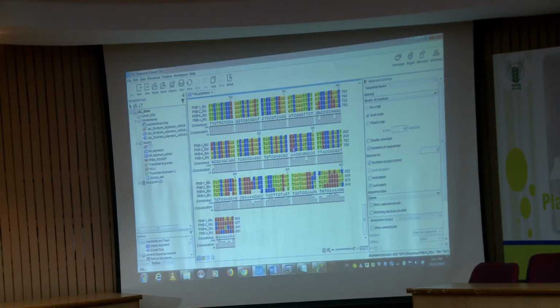But whether it is actually a deletion or not, I have to go back to my chromatogram file and check whether after this A, a C is coming with a good peak, or some blurred or mixed A is also coming. If something is there, then I have to consider both forward and reverse data, and then only I can replace this deletion with the A. Then this deletion is not actually a deletion, it is bad quality sequencing data affecting over here.